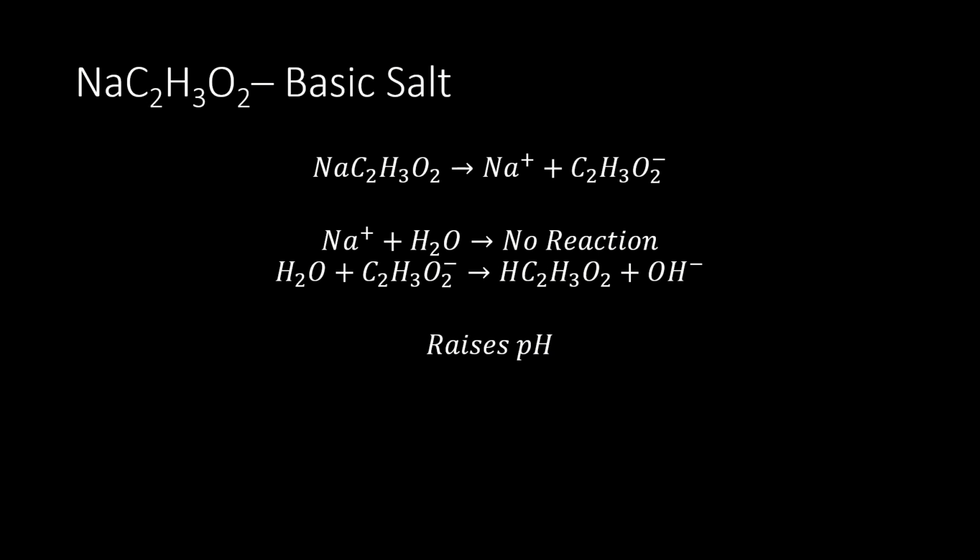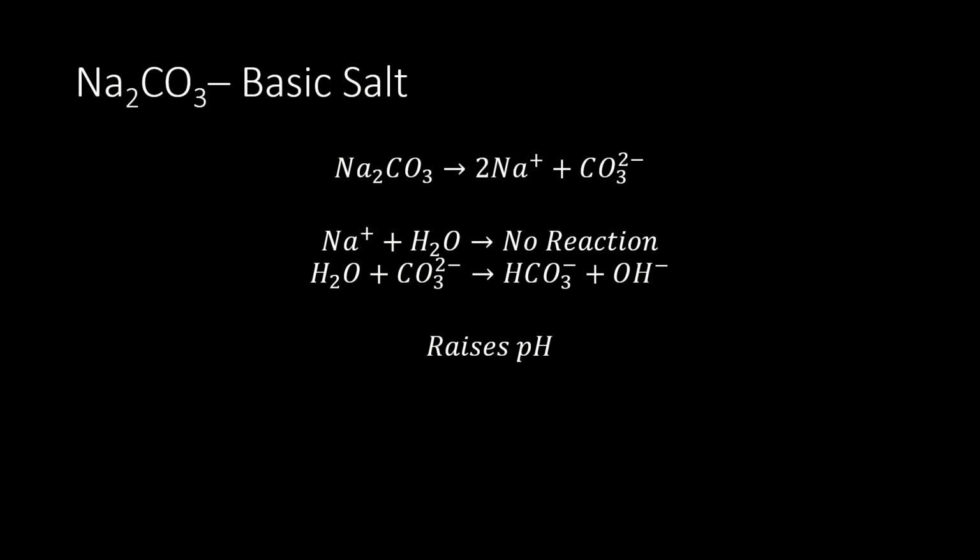For a clearly basic salt, sodium acetate, breaking up into sodium and acetate ions, the sodium ion should have no effect on the pH, but the actual interaction with water, the actual one you would write down in your post-lab report, is water reacting with the acetate ion to form acetic acid and a freely available basic hydroxide ion. Because hydroxide ions are becoming available after adding this salt, it should raise the pH of your solution.